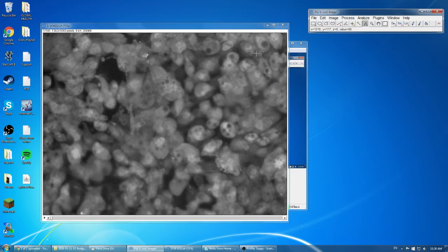So I deleted 50 seconds off of the first set of images, since each of these images in my time lapse is a 10-second interval. So now we're going to have a little clock here at the top left, so when the movie is playing, people will know how far along the time lapse has gone.